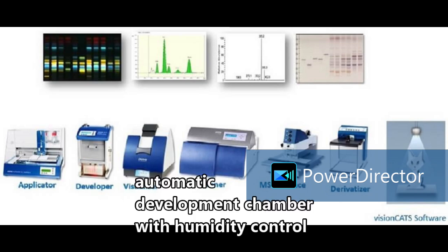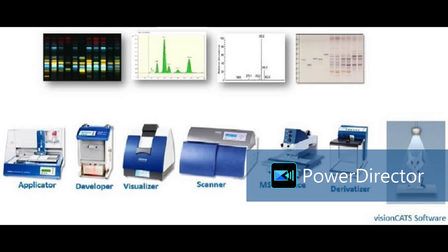We can maintain 33% humidity exactly during chromatographic development. Here this is entirely automatic. Just keep the plate, hang the plate here inside, pour the mobile phases and give command from the top. It will saturate the chamber automatically. It will maintain the 33% humidity. Plate will go automatically into the mobile phase, come out automatically. And here there is a sensor. That sensor will see the wet portion of the plate, and after reaching the solvent point, it will take out the plate. So no manual observation is required here. Completely automatic development chamber.